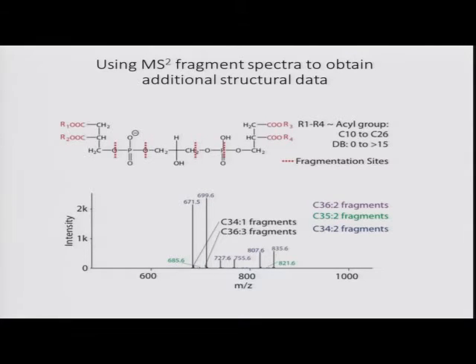But for the run that I showed you before, I have about 2,000 to 3,000 of these spectra, and it's a lot of work to annotate a single spectrum of that. So that's why I wanted to go for a mathematical solution in which I can automate this process, not being forced to spend weeks and weeks on analyzing one single sample.